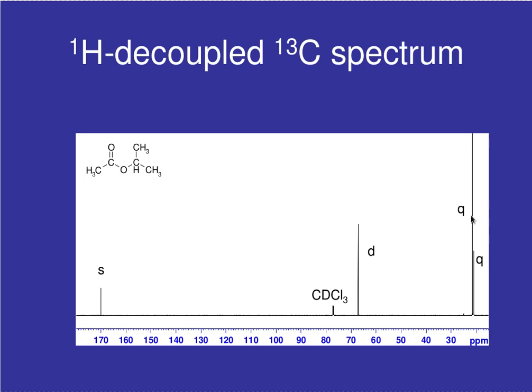The question is, how do we deal with that? Well, of course there is some chemical equivalence, and so within the isopropyl group you'll notice that these 2 methyl groups are identical to each other, and if they're chemically equivalent, if identical, the signal will appear at exactly the same point in the NMR spectrum.